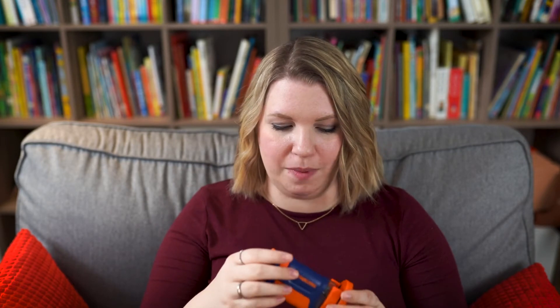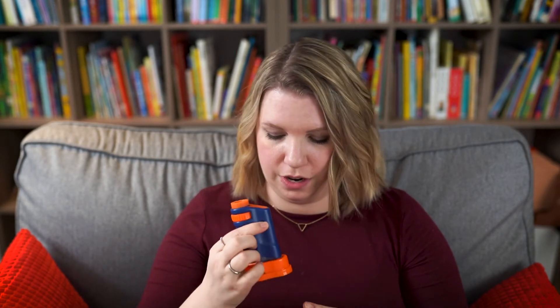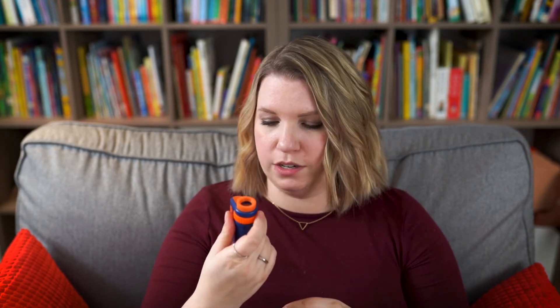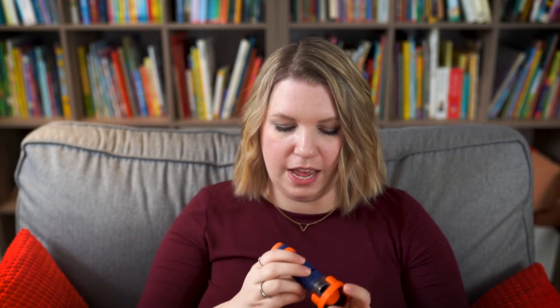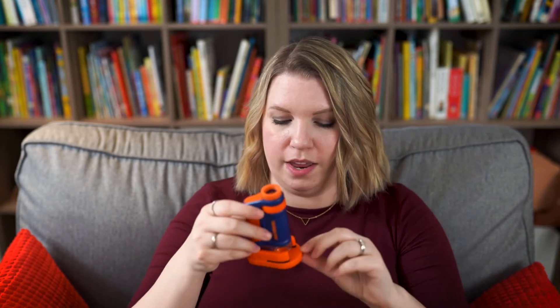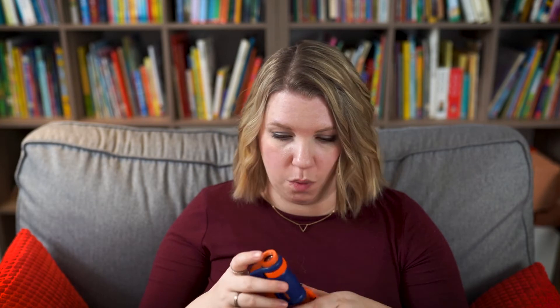This teeny tiny little microscope fits in the palm of your hand and it is super kid friendly. It has basically three buttons: your on and off button for your light, your zoom at the top which goes from 20 to 40 times magnification, and a little focus button. It comes with three slides — one is pre-made and you can set up some slides of your own. It is just a great little microscope that really any kid can use. Zoe can very easily use this microscope and she's four. It's not complicated, and it has great quality.